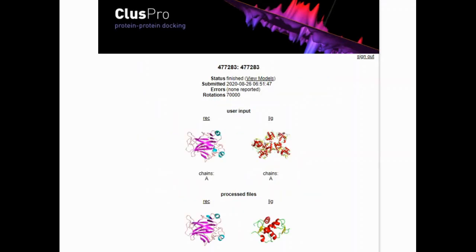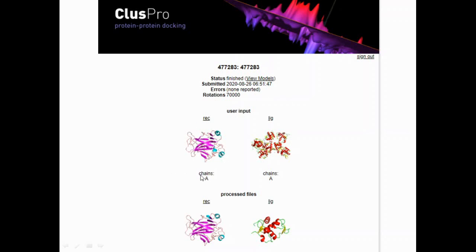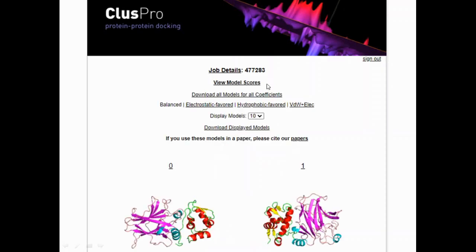After you click on dock, it takes a little bit of time for the docking to be performed—roughly about half an hour or one hour depending on how the queues are. Once that happens, you get your final output, you get your status as finished, and this is your user input where you had incorporated your first chain, that is P53, and your second chain is MDM2, which was your ligand. Then you get a list of the processed files. When you click on view models, this is where you can get the entire results.